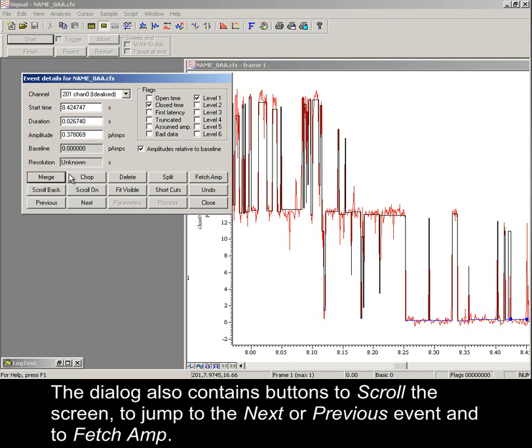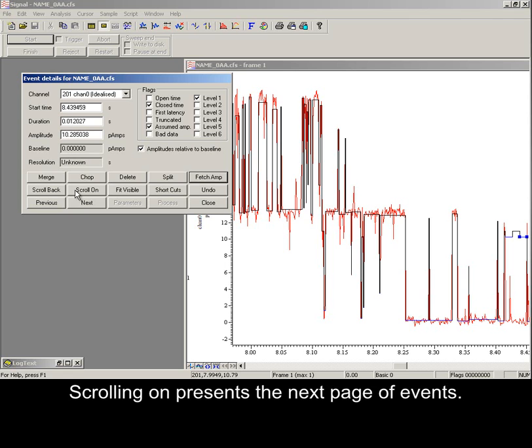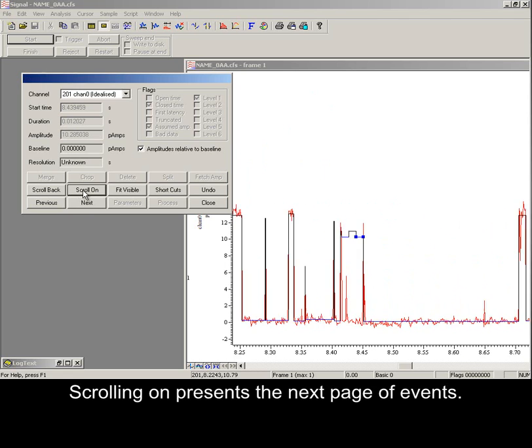The dialog also contains buttons to scroll the screen, to jump to the next or previous event, and to fetch amp. This scans backwards to find an event of the same type, and copy the amplitude of this previous event to the current event. Scrolling on presents the next page of events.